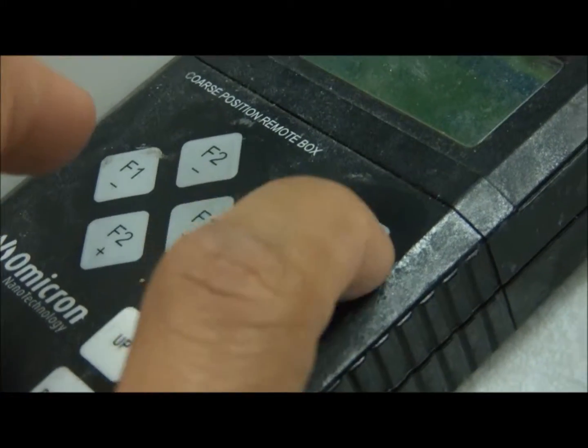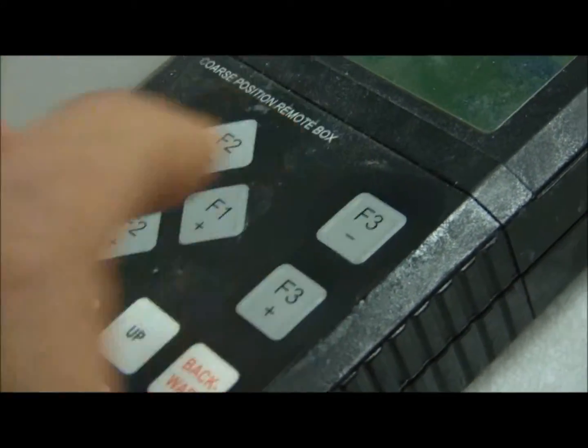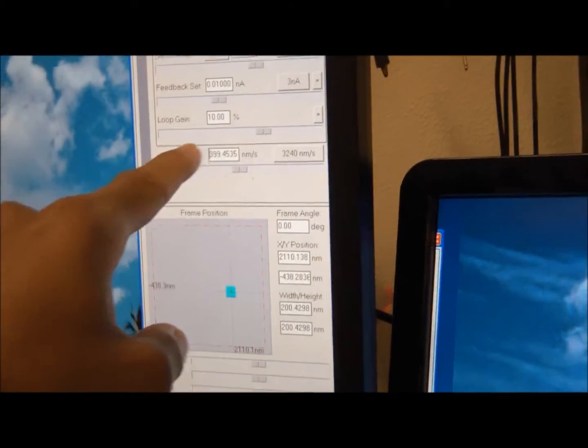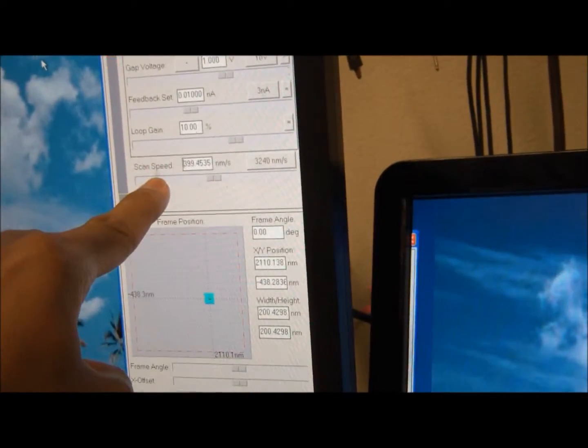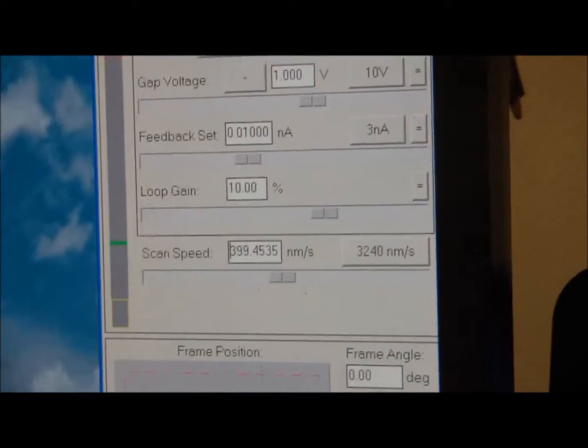I'm going to count: one, two, three, four. It should be in between — usually in between the loop gain. You'll see a green knob in between loop gain and the scan speed. We'll make it automated again — press forward, and now it's automated. As you can see, it's in between. That's where the needle is.